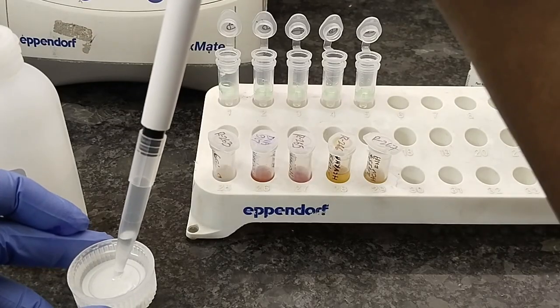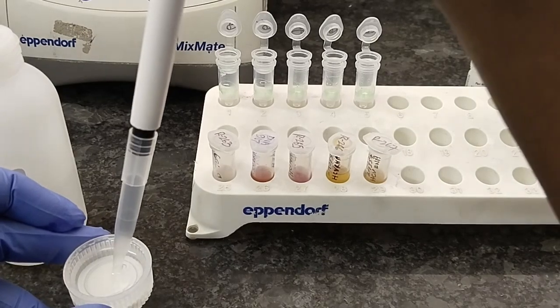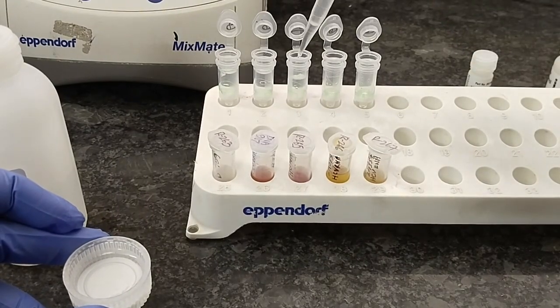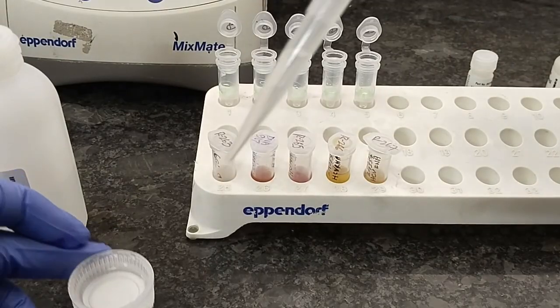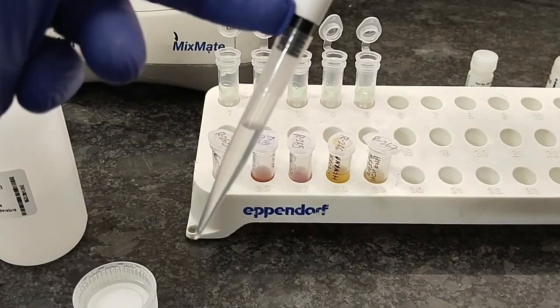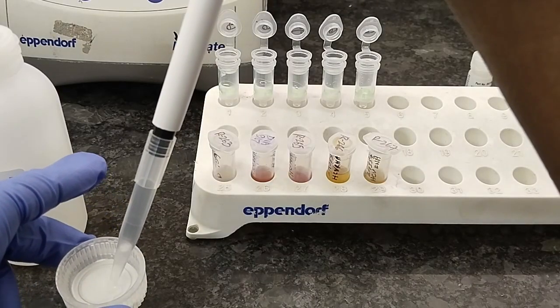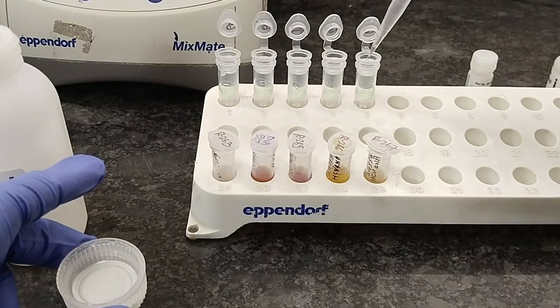In molecular biology, contamination is a great concern, so you have to be very careful during addition of each reagent. If I use the same micro tips, we have to make sure that the micro tips do not touch the binding column.